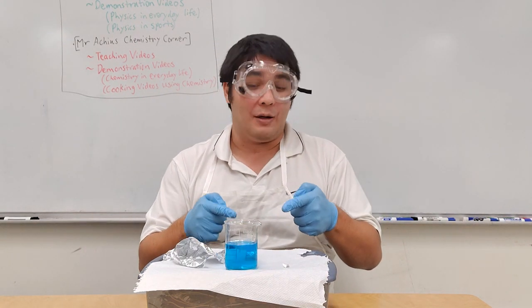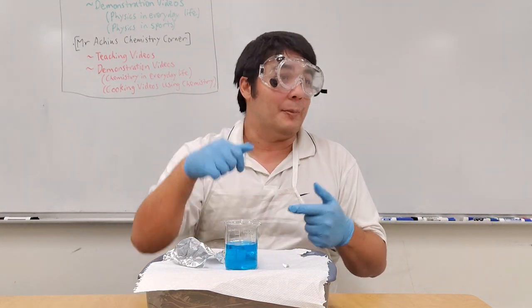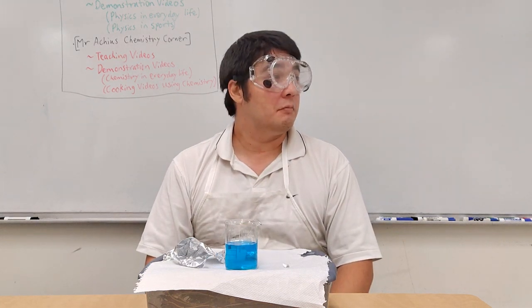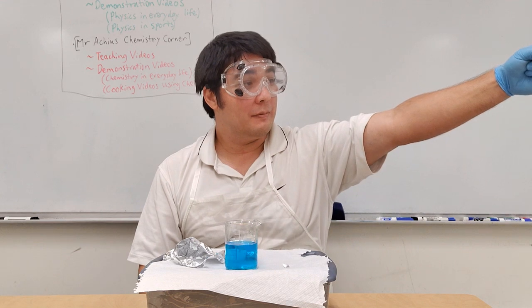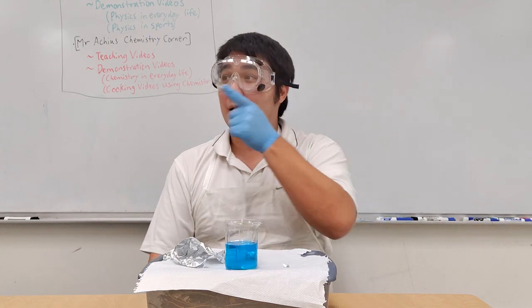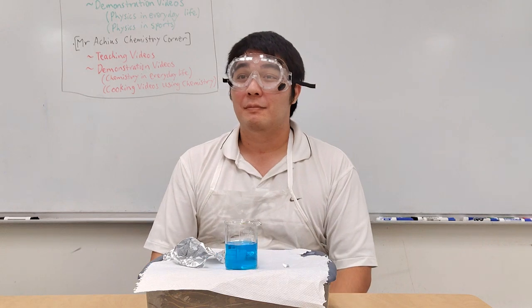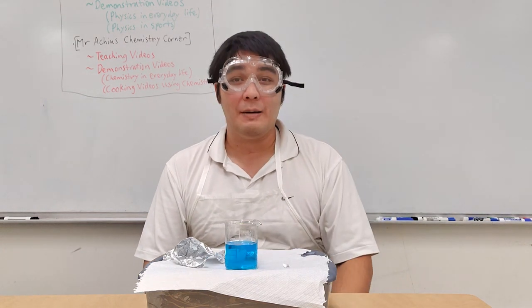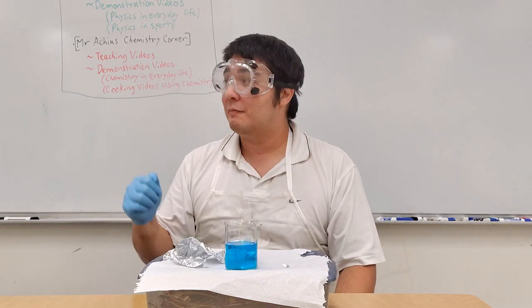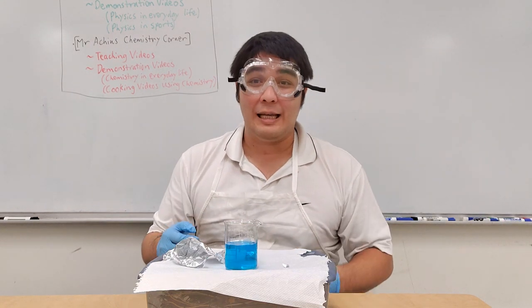What do you think is going to happen when we have the single replacement reaction of aluminum in the copper chloride? What's going to happen? I think the aluminum is going to be stained. Sorry, say that louder. I think the aluminum is going to be stained. Okay, the aluminum is going to be stained. All right. Other ideas, other predictions, the hypothesis basically of this lab. It's going to be heat generated. Heat's going to be generated. Okay, sounds good. Any other ideas? All right, if not, then that's fine.